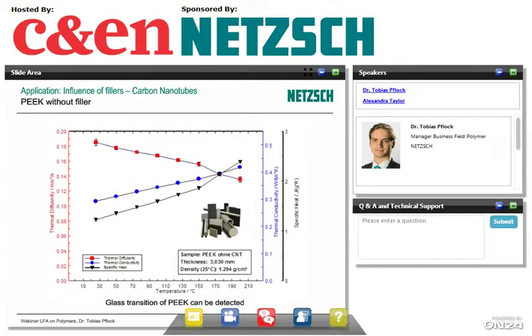And boron nitride is very commonly used. What is also used, especially in research, is carbon nanotubes. In this case, we have a sample with polyether ether ketone (PEEK). The first sample has no filler, so we measure thermal diffusivity, thermal conductivity, and specific heat.